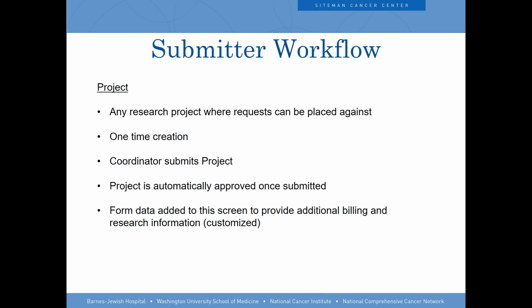So basically, there's two modes for projects to be approved. And when we were working with Krishagni as collaborators on designing this module, we thought that it would be good to have this stopping point where a user would go in and create a project, and then, conceptually, the idea was that somebody at the tissue procurement core would do a, quote unquote, scientific review and say, well, this is silly.